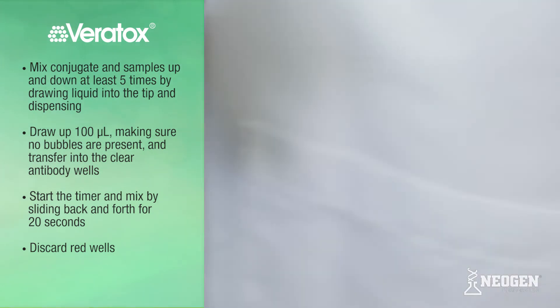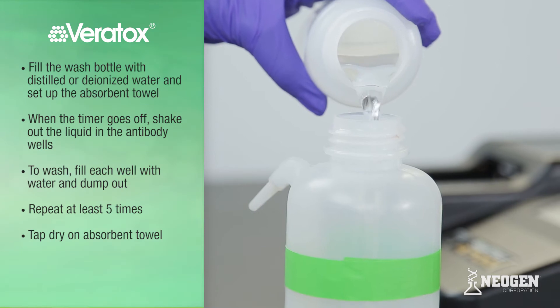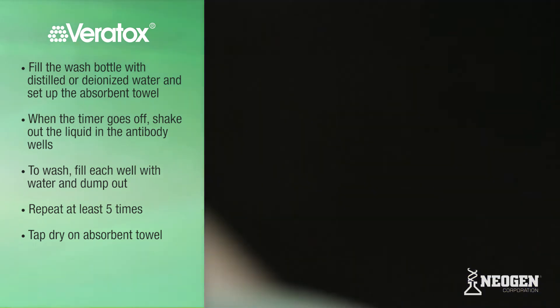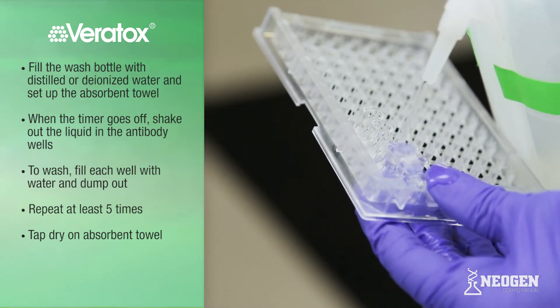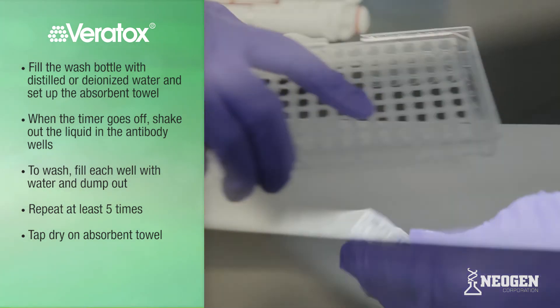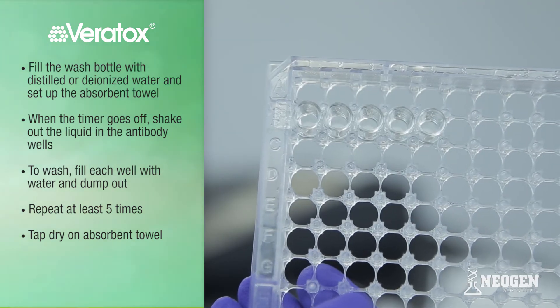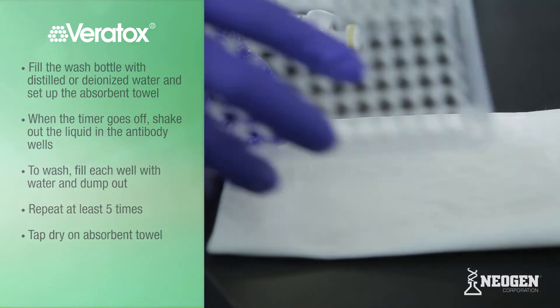Refer to the test kit insert for specific timing of other mycotoxin test kits. While this is incubating, fill the wash bottle with distilled or deionized water and set up the absorbent towel. When the timer goes off, shake out the liquid in the antibody wells. To wash, fill each well with water and dump them out. Repeat at least 5 times. Turn the wells upside down and tap dry on an absorbent towel to remove excess water. Check for excess water or bubbles; if present, tap again to dry. Do not put anything into the well or blow air to dry — just tap.